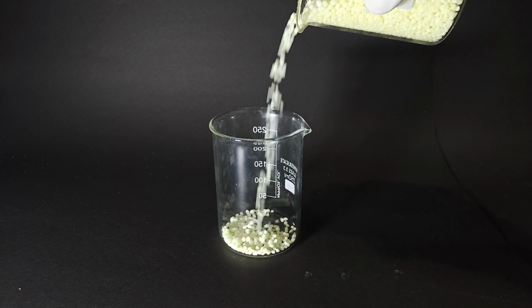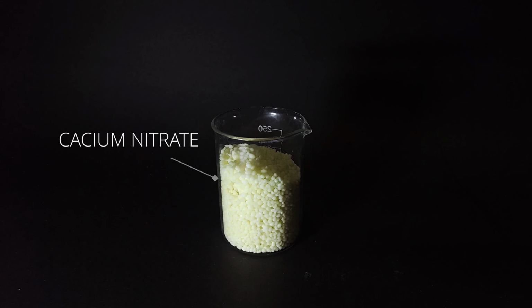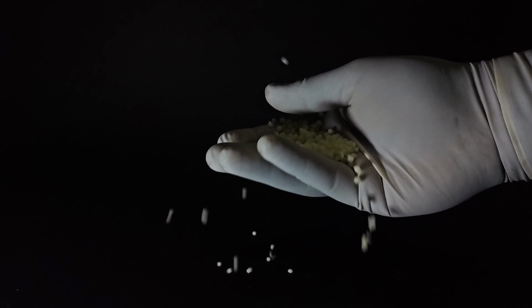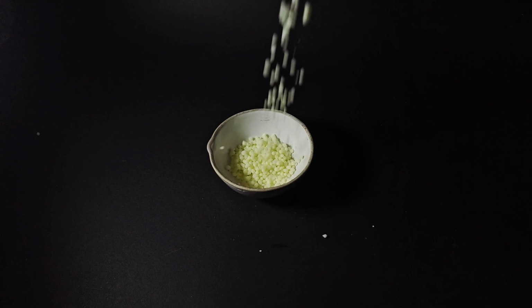Today, in this video, I will convert fertilizer into nitric acid. This is calcium nitrate, commonly used as fertilizer for many plants. Just like other fertilizer, it is also in pellet form. So before going forward, we need to crush it down.